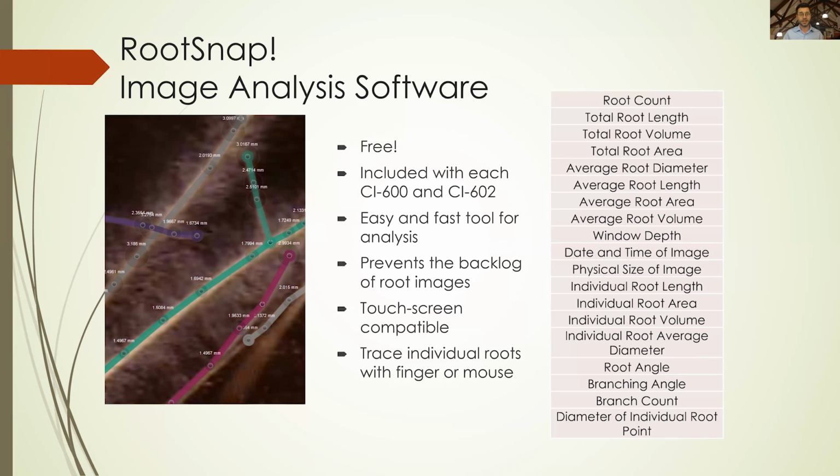Now, the great thing is you can start playing with it today if you would like. We provide it for free on our website, and we also include it with each one of the 600s and 602s. And we're constantly updating it. There are some updates being pushed fairly soon, within the next month, by our software engineers. It is a very easy and fast tool for analysis. It prevents backlogs of root images by being a lot quicker than more traditional means. And it has a few features that I really enjoy, which I think make root analysis a bit easier than I've typically been accustomed to.